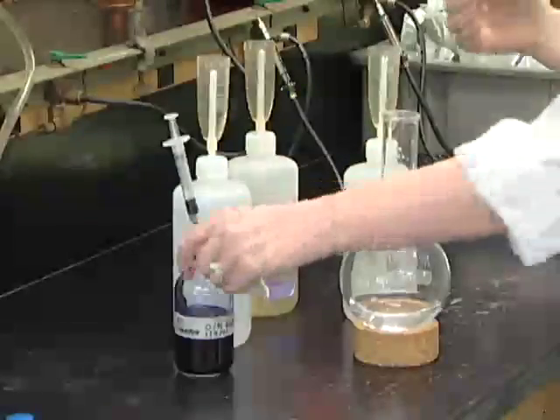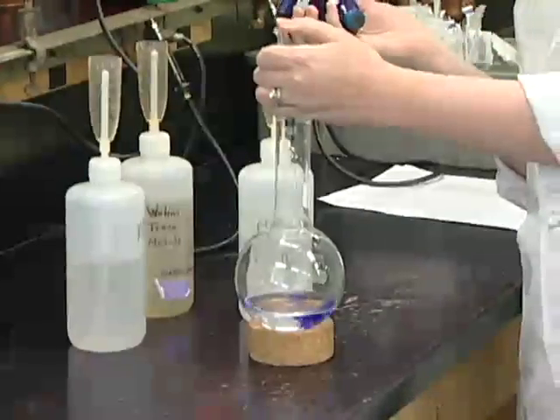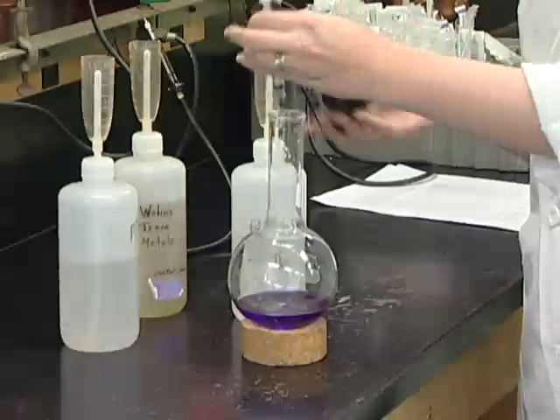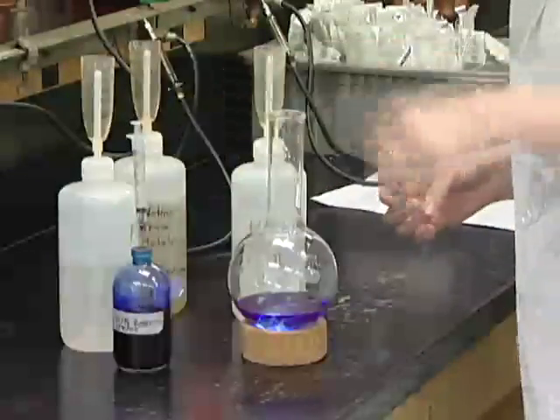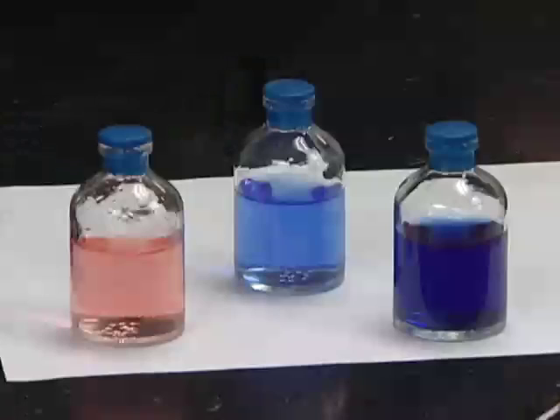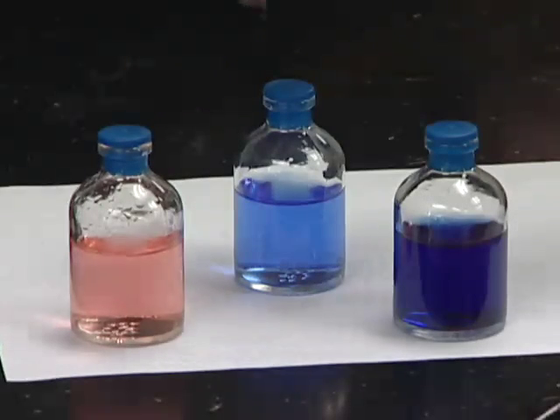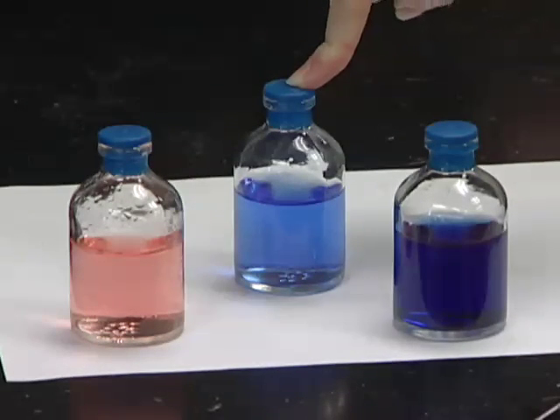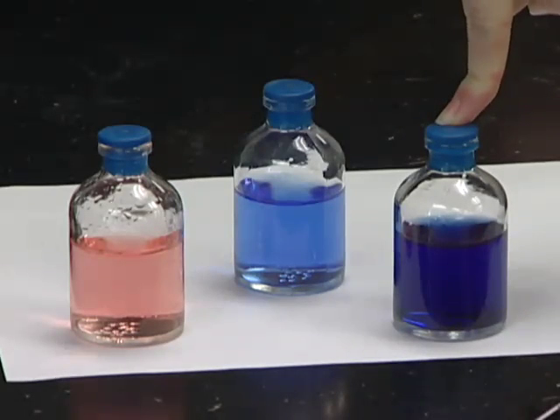I'm also going to be adding an indicator called rosazurin, which, as you can see, starts out blue. This will help us tell the pH of our media and later on whether or not we have any oxygen contamination. This media will be pink at an acidic pH, blue at a neutral pH, and a darker blue, if not sometimes cloudy, under basic pH.